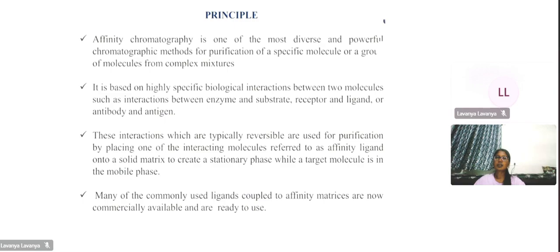So we discussed the principles. First, affinity chromatography is one of the most diverse and powerful chromatographic methods for the purification of a specific molecule or a group of molecules from complex mixtures. It is based on highly specific biological interactions between two molecules, such as the interaction between enzymes and substrates, receptors and ligands, or antibody and antigen.